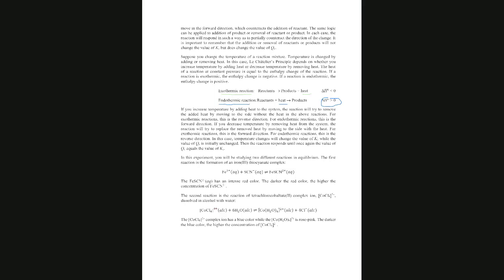Since you are not in the lab, you are going to be given the observations, and you will need to say if the reaction moves towards the reactants or towards the products. So the first reaction is this reaction here.